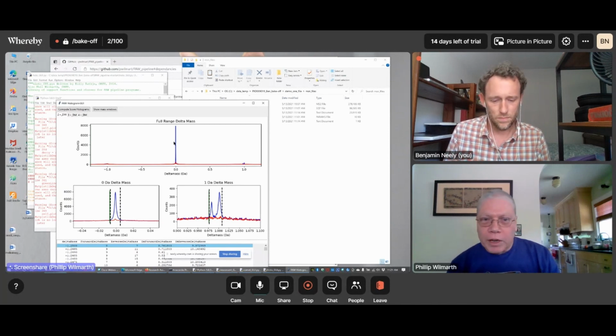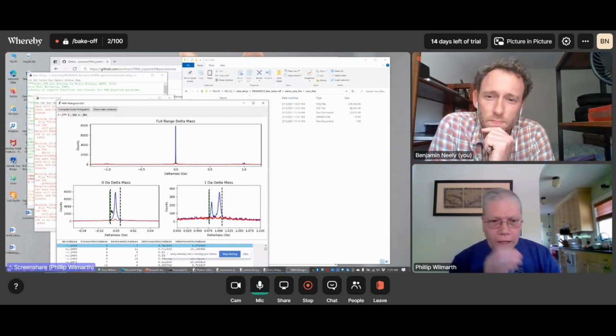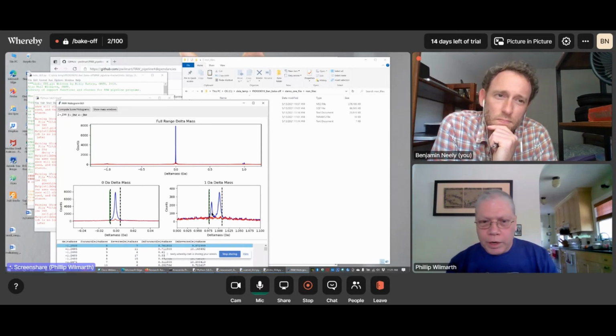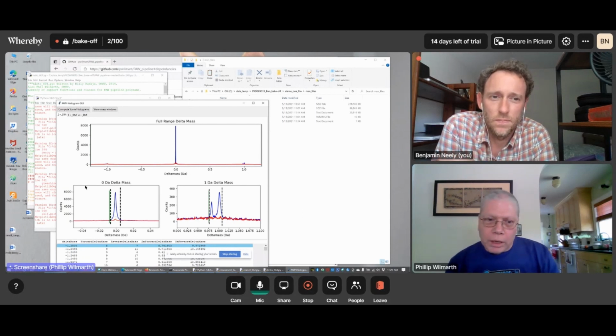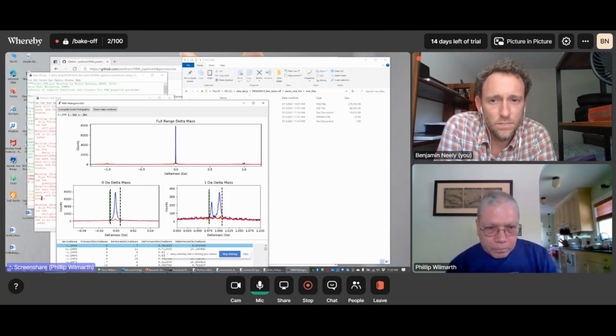So here, now we see that we've got a very sharp 0 Dalton peak. We got this wide full range view, and then we've also got an expanded scale around 0 Dalton, expanded around the 1 Dalton region. In the 1 Dalton region, we've got 2 peaks here. The first one is caused by deamidation, so that's a 0.984 Dalton mass shift. And the other one is a 1.003 mass shift that's caused by capturing the first isotopic peak instead of the monoisotopic peak. And one of the nice things about doing this wider tolerance search is you don't have to specify deamidation, or you don't have to do a narrow tolerance search with isotopic errors allowed. You can just do a search without specifying those extra things and still capture those identifications here.